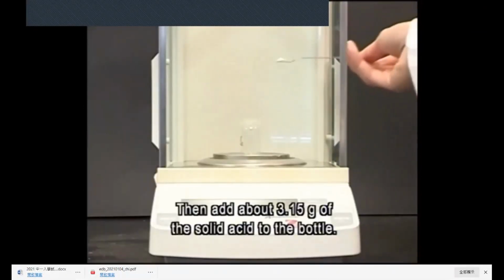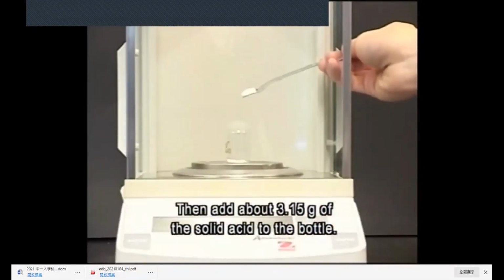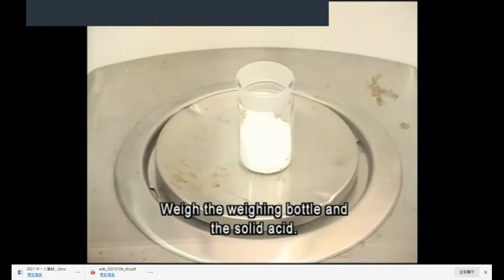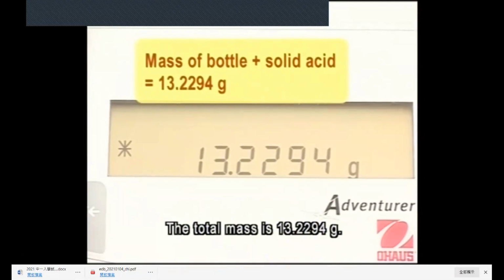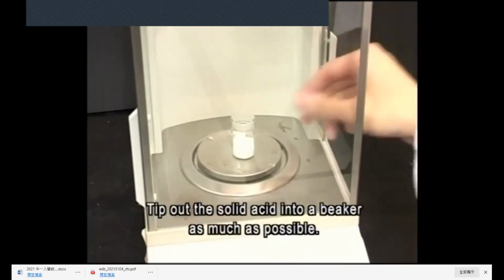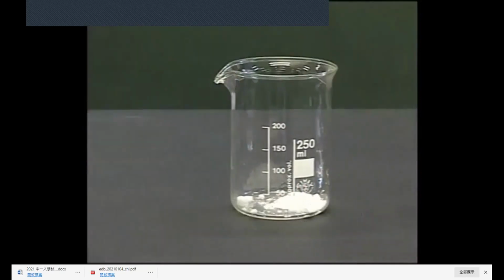Then add about 3.15 grams of the solid acid to the bottle. Weigh the weighing bottle and the solid acid. The total mass is 13.2294 grams. Tip out the solid acid into a beaker as much as possible.